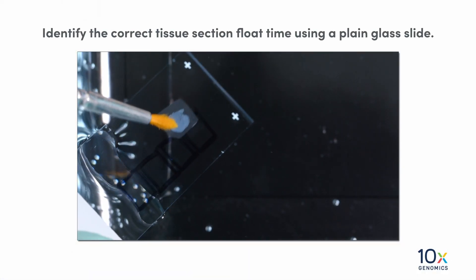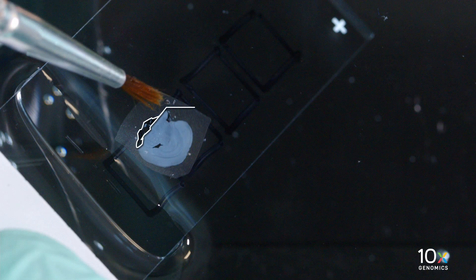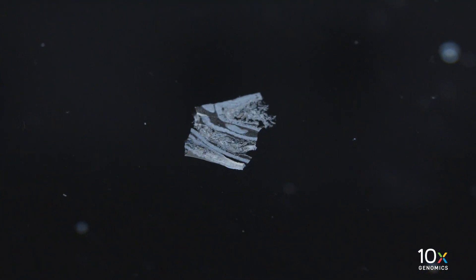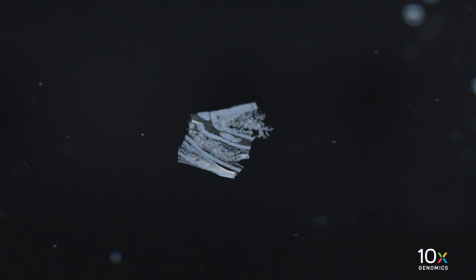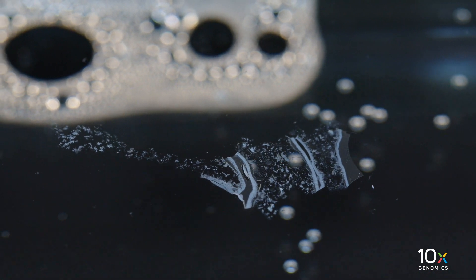Identify the correct tissue section float time using a plain glass slide. Tissue will disintegrate if it floats in the water bath for too long. In this case, the tissue is beginning to disintegrate. Here, the tissue has been left in the water bath for too long and is disintegrated.